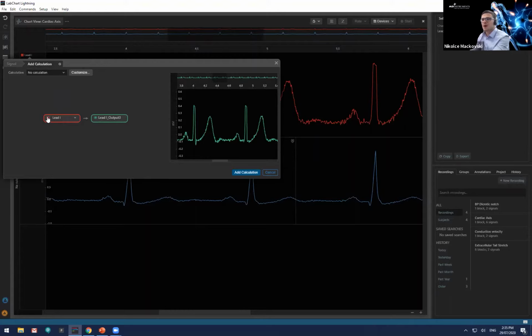And we have an I here. So this I simply can hide my signal. It's quite simple at the moment, but when we do some more advanced calculations, then it becomes really apparent how important these are. So if I just hide this, you can see it just shows my first input only. Alternatively, if I hide that, it's just going to show green, but that's fine. But that's what the eye does.